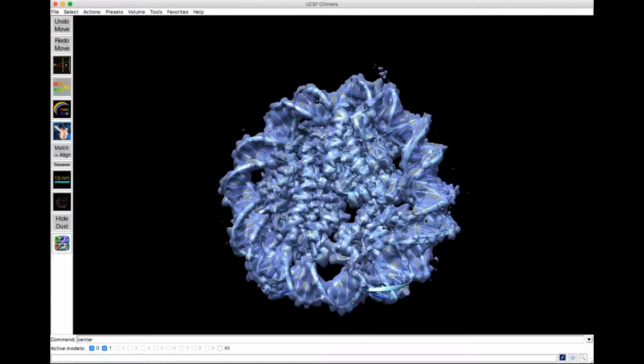So yeah, number of outside, you should maybe just delete those atoms. And then it seems like this is more of a subjective viewing thing rather than an objective number to look at per se. It's quantitative, and I think if I was refining this model myself, I could then use this as a metric to judge how well my refined model fits.